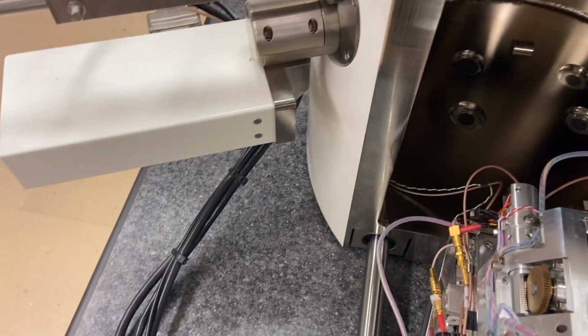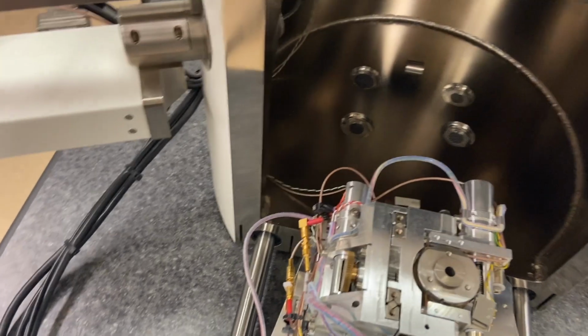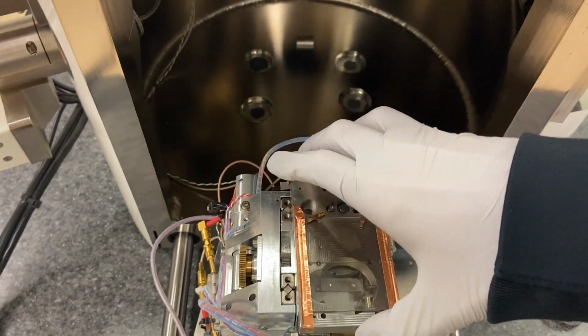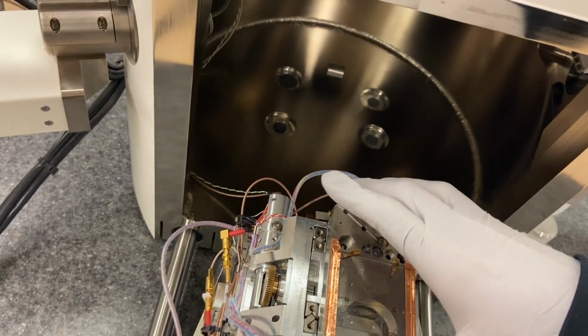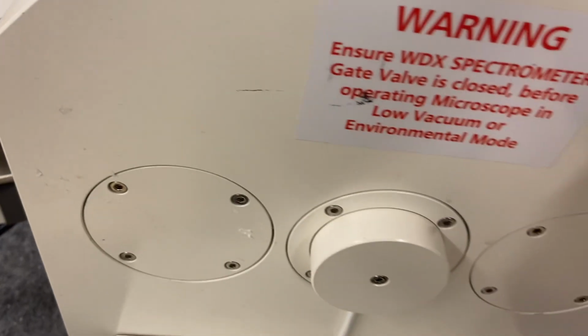There we go. That looks to be a little off, so I'm going to go back the other way. It's a little hard doing this with one hand, but I'm going to try my best. Okay, that's about parallel. Now I'm going to take this and line it up like that. To do that, I use my other hand to hold here, and then I do this. Make sure that it's nicely settled and it's not moving, which it's not. And I push it in like this.